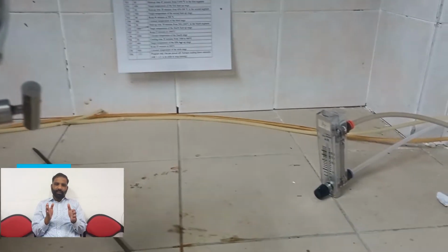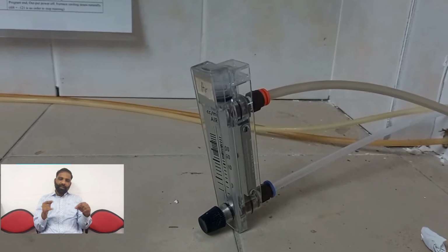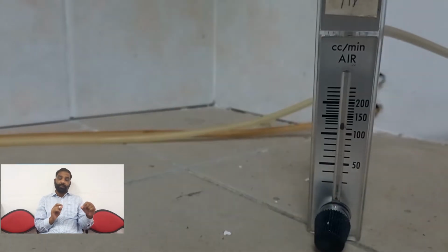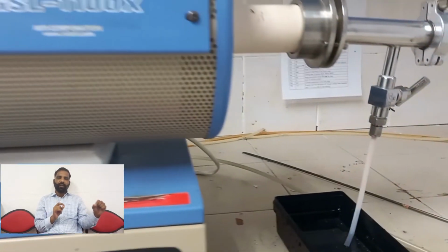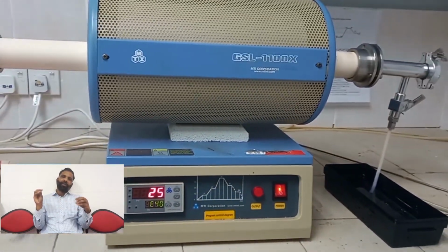For the standard operating conditions of the solution treatment, you run the argon gas from the control room. When argon gas flows, you must make sure the flow rate is around 50 ml per minute or 100 ml per minute. After that, we will close it.